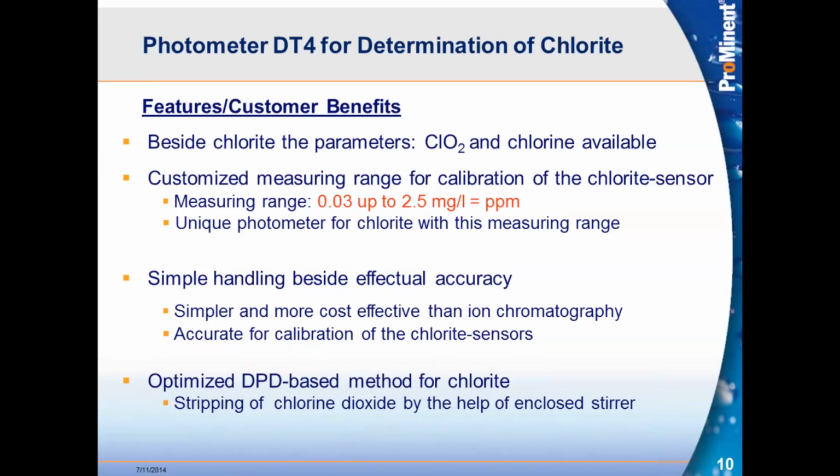We use a liquid for the reagents, and that's nice because we pour the sample in over there, and it can help us avoid some of the scale that can corrupt some of the other types of powder pack units that are added after you already have the sample in. So there are some advantages. Again, with our unit, or with other manufacturers' units, any kind of suspended solids in that water can cause shadows, it can cause reflections. If you get fingerprints on the little sample jar, that can cause a problem. If you don't clean the sample jar regularly, you leave it stained. That, of course, is going to show up. It's not going to let as much light go past, and it's going to look like you have more residual in your application than you potentially actually do.